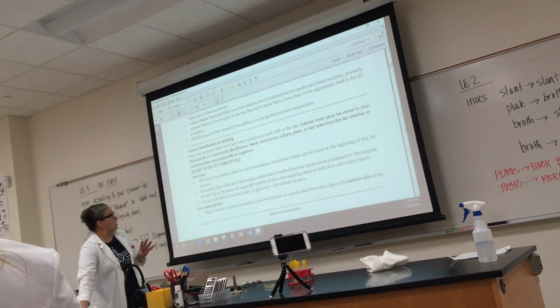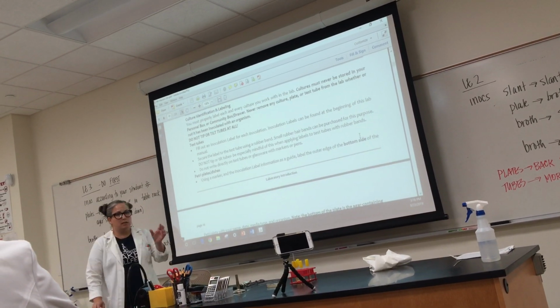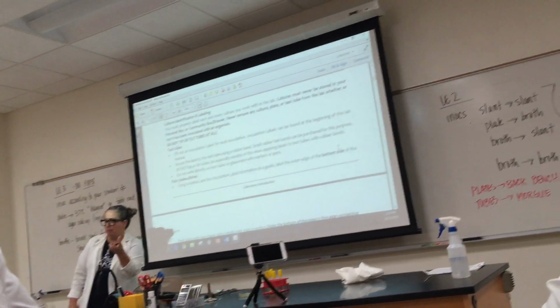And one thing that I'm going to demo for you, right, but you don't want to tilt your tubes. When you tilt them, you can spill what's in them.